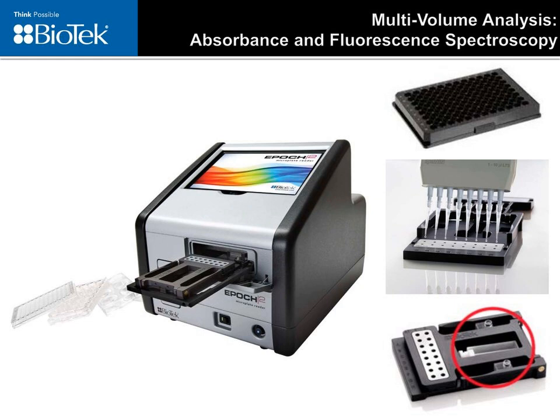This is achieved by the ability for the reader to accommodate an array of vessels with a standard footprint. Commonly used microplate densities range from 6 to 1,536 wells per microplate, with each microwell capable of holding volumes ranging from tens of microliters to tens of milliliters.